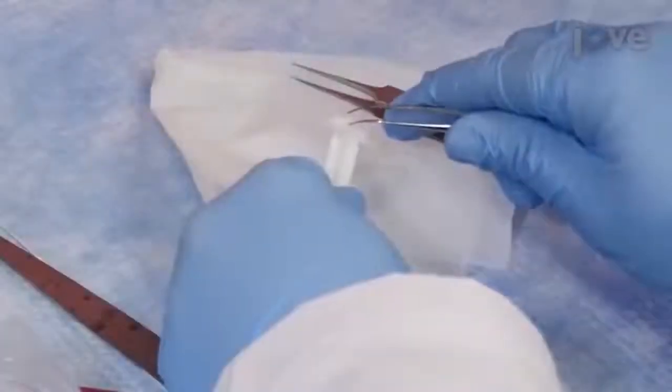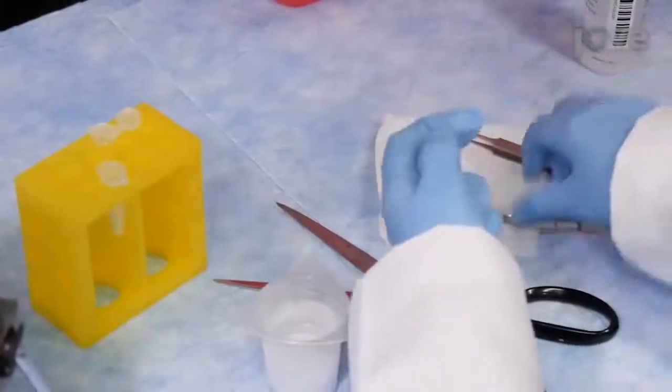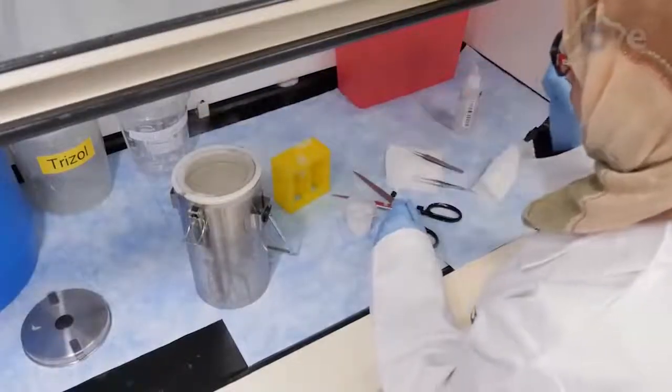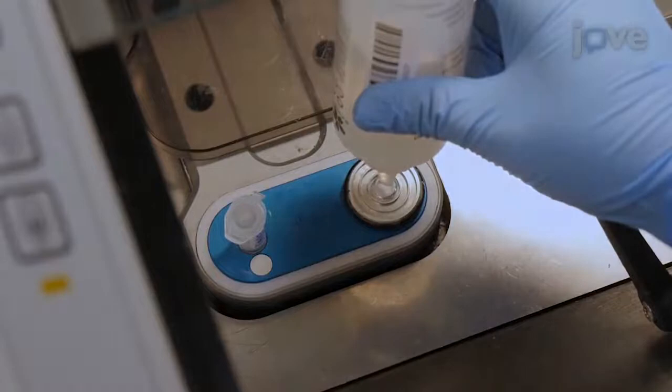Use forceps to detach the embedded tissue from the plunger and transfer it to a 1.5 milliliter microcentrifuge tube, then store the microcentrifuge tube in liquid nitrogen. To start cryostat sectioning, add a drop of OCT compound onto the center of the specimen holder of a cryostat and allow it to partially solidify.